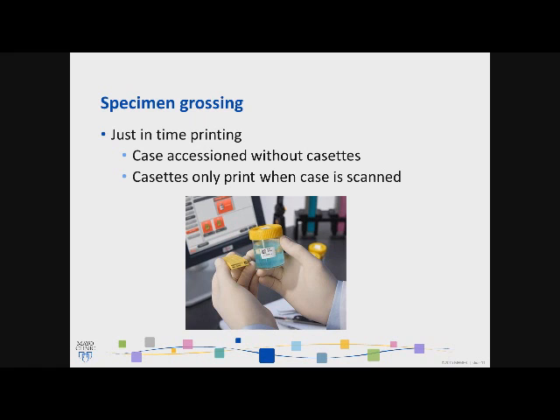In the LIS, we recommend putting the minimum number of blocks associated with that case and then just adding additional blocks, because it's often very difficult to remove blocks in that system. So it's a very lean and nice process. This is nice because you verify that the material has been grossed at this time, and then it is transferred to the next step.